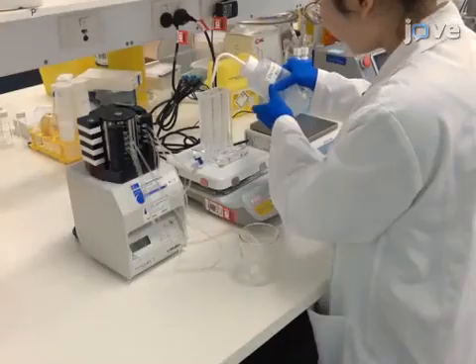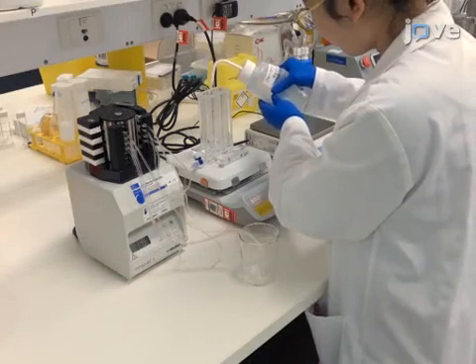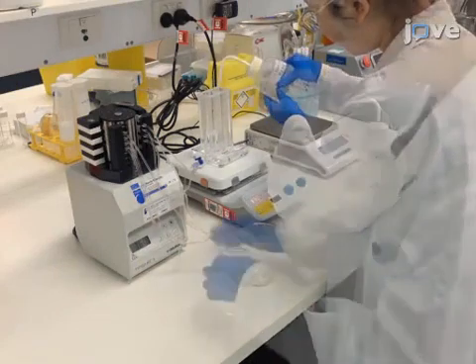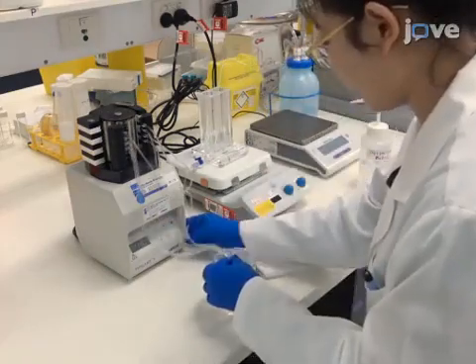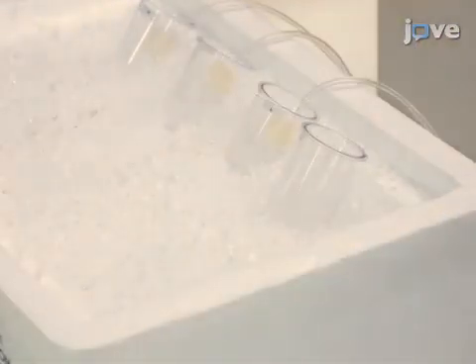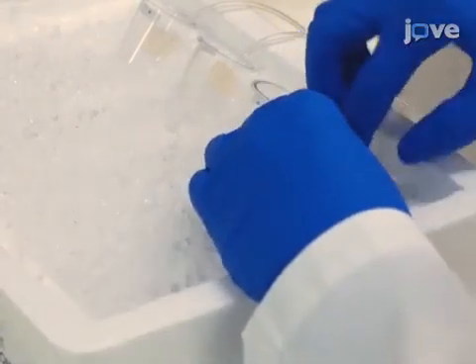On the day of mitochondrial isolation, wash the gradient pour and PVC peristaltic tubing with deionized water to prepare the gradients. Then incline and position two 50 milliliter centrifuge tubes on ice such that the peristaltic tubing outlet touches the wall of the tubes.